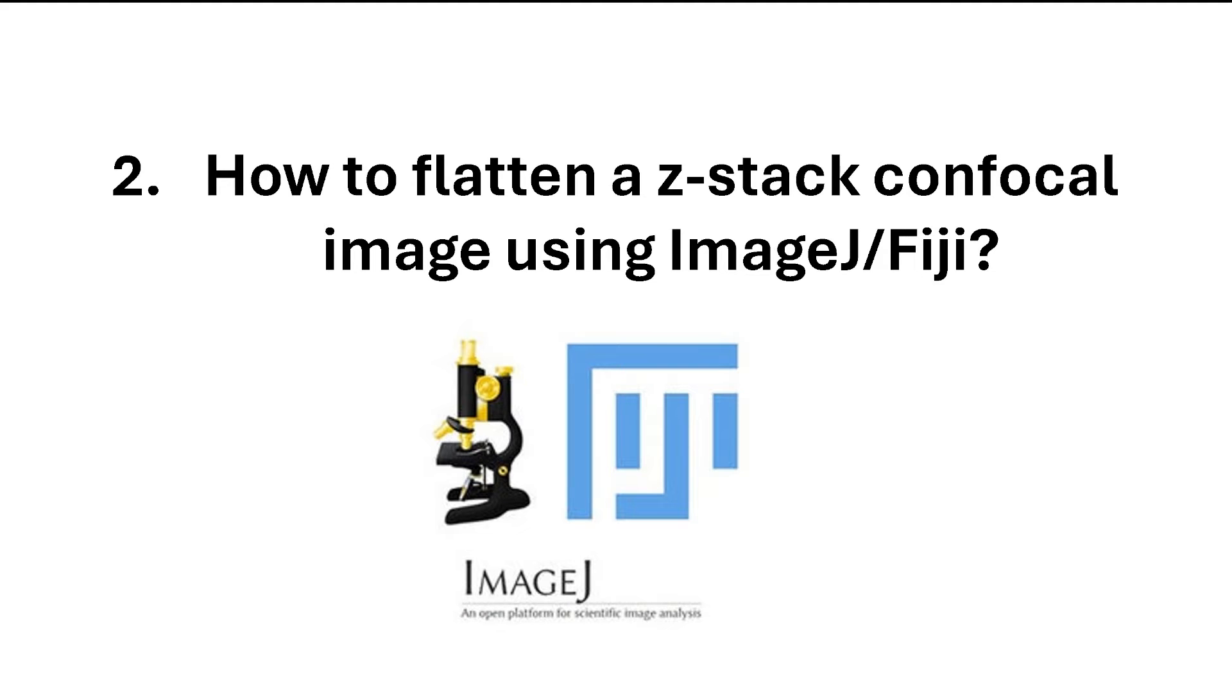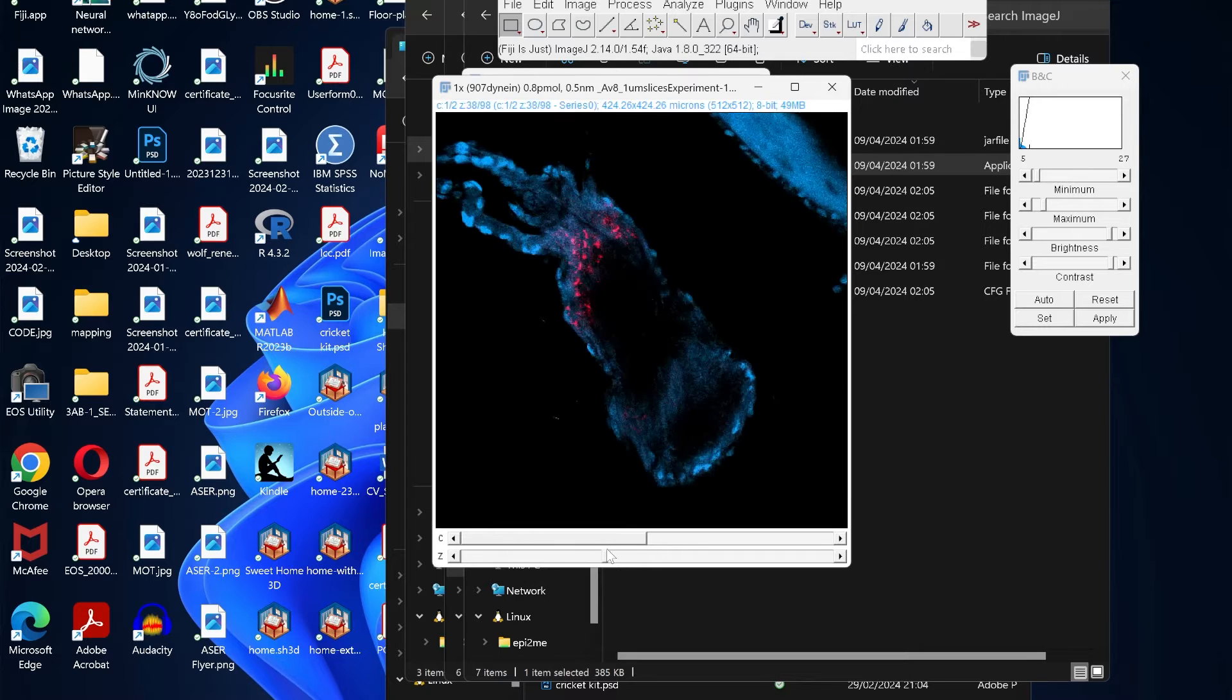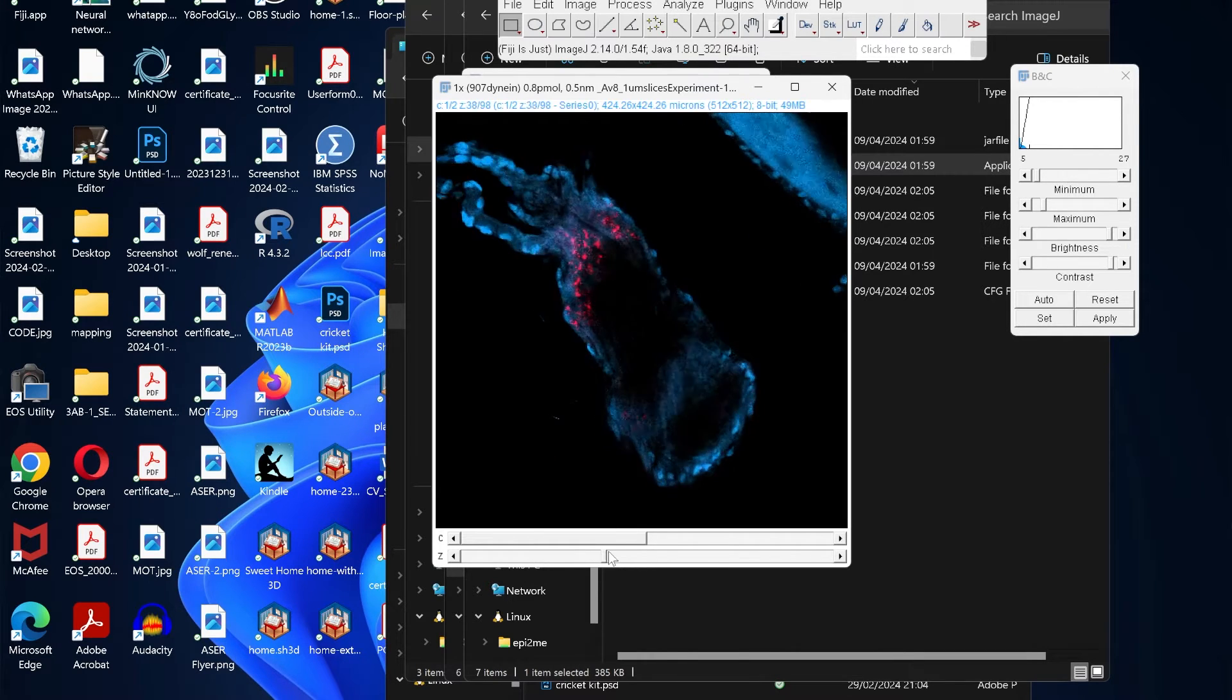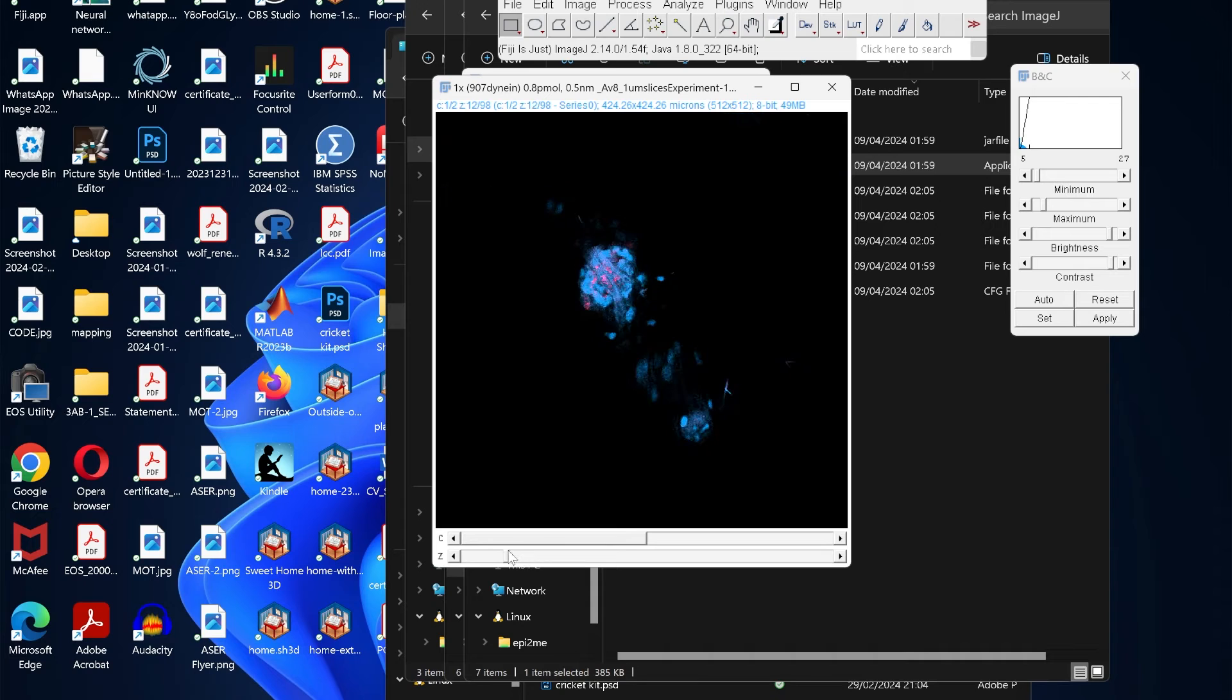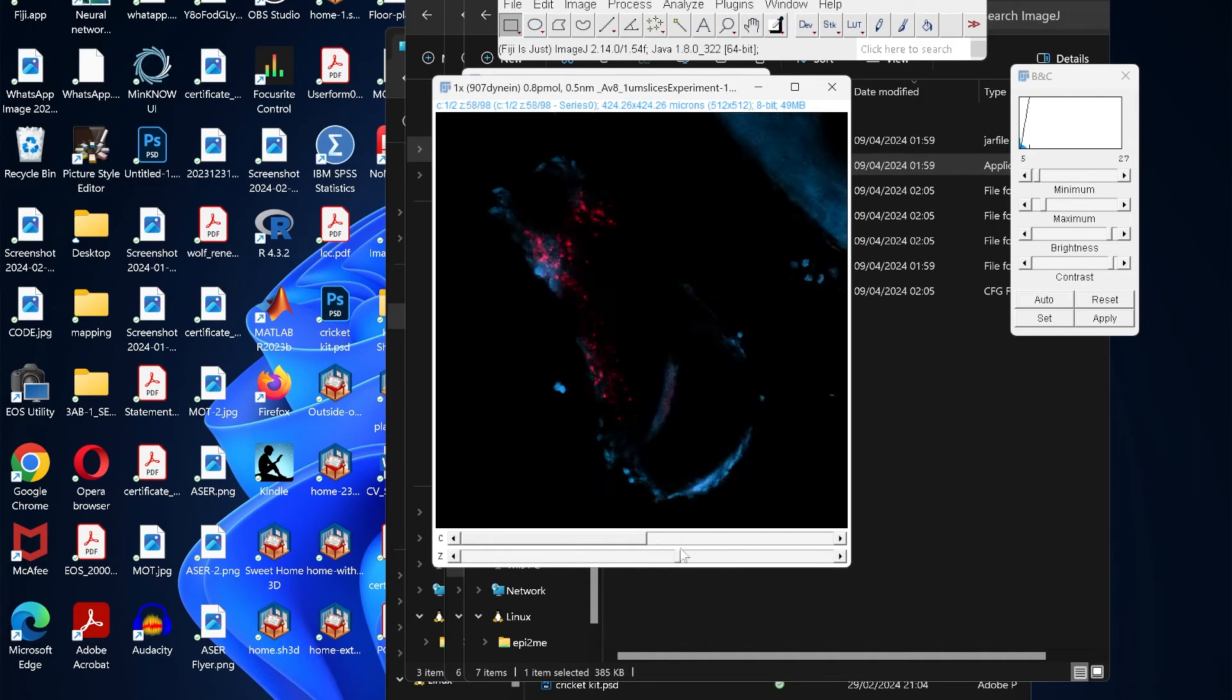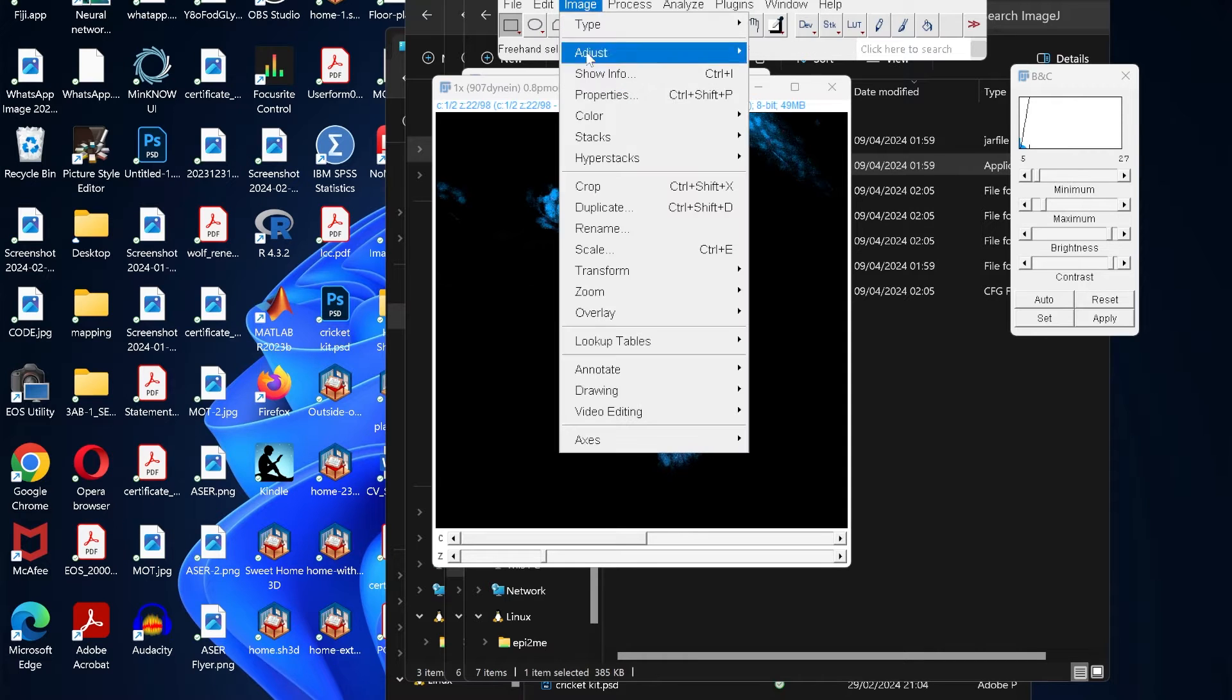How to flatten a z-stack confocal image using ImageJ or Fiji. Once we open a z-stack image, we see that it's not a single image but a combination of many z-stacks. It's important to merge all these layers into a single layer so we can see the image nicely. To do that, click on Image.